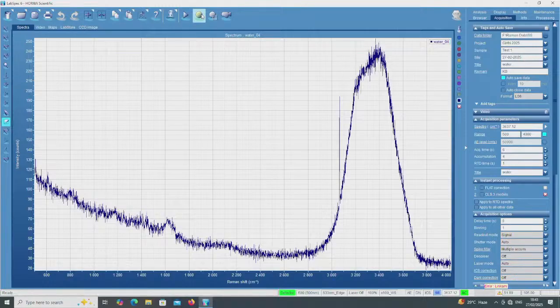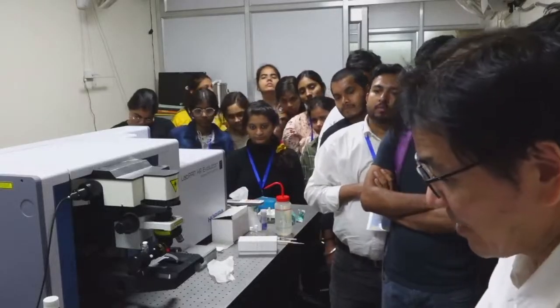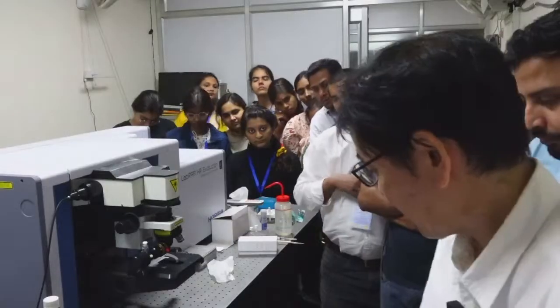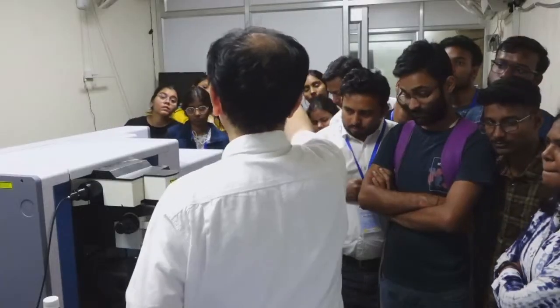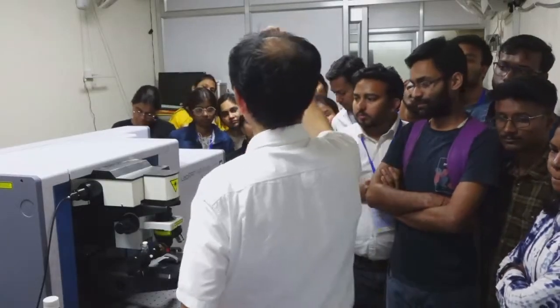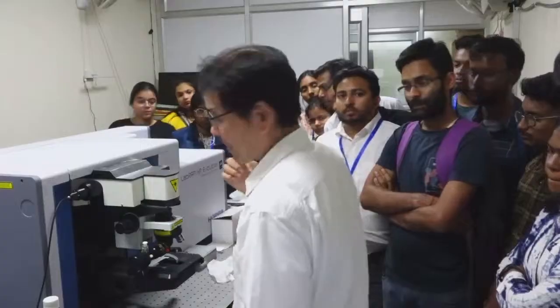The vibrational band of a liquid sample should have a certain width, and this is extremely sharp. So we should not regard this as a real vibration band. If this were a vibration band, it would mean the vibration continues for a long time, so we can define the frequency uniquely. Instead, this is not a vibration band. In space, there are particles flying from the sun or somewhere, and such a high energy particle passes through the CCD plate by chance.